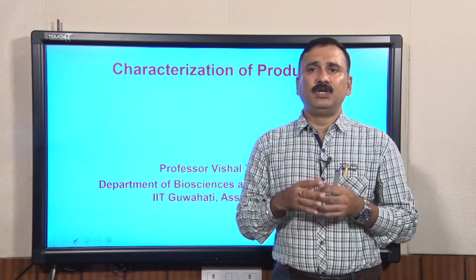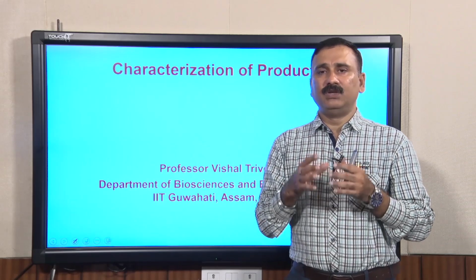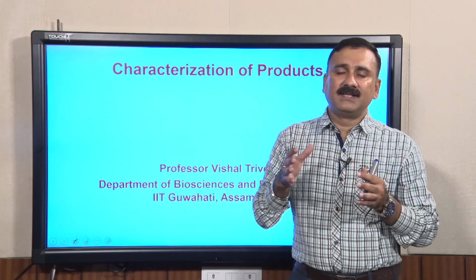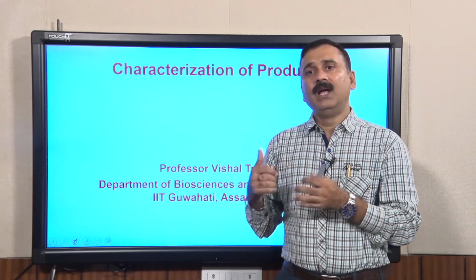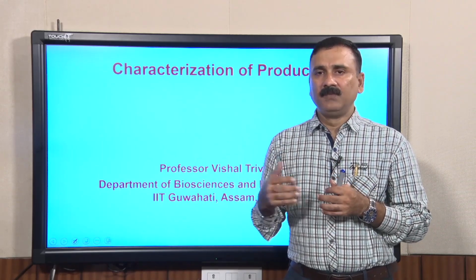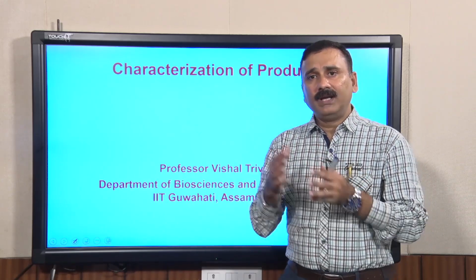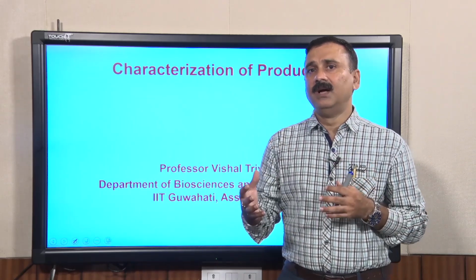Continuing our discussion about UV visible spectroscopy, in today's lecture we are initially going to discuss how UV spectroscopy can be used to know whether structural changes are happening in the molecule or not, and subsequently we will discuss IR spectroscopy to characterize the functional groups present on the molecule. So, let us start with UV visible spectroscopy, and how the absorption spectra is modulated when you have different types of changes in the molecule.